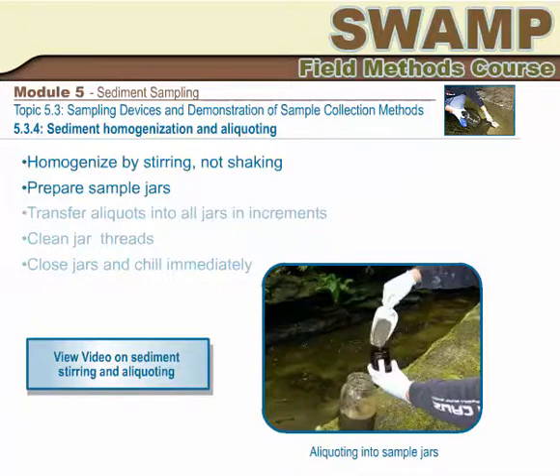All sample labeling and identification information has to be recorded and taped onto the sample jars prior to aliquoting. Transfer the homogenized sediment into all the jars. For better representation of the size fractions in the aliquots, organize all the jars you want to fill from this homogenate in a row and add the scoops of sediment incrementally, 1 scoop per jar, then start the round again.